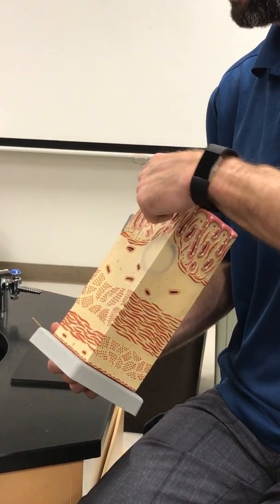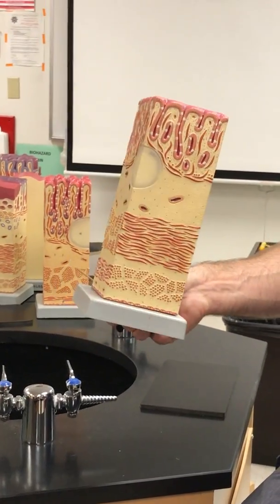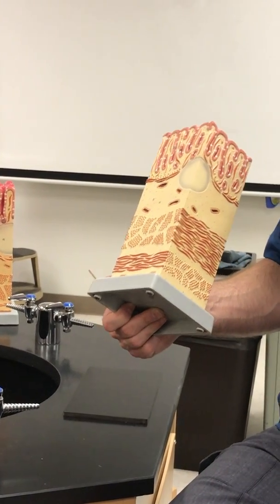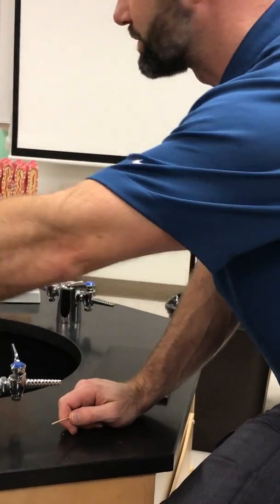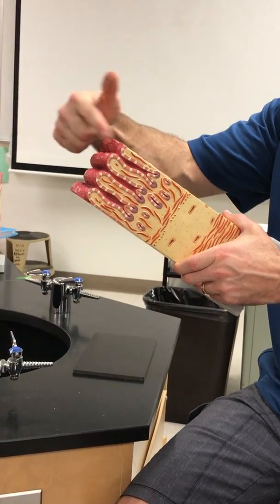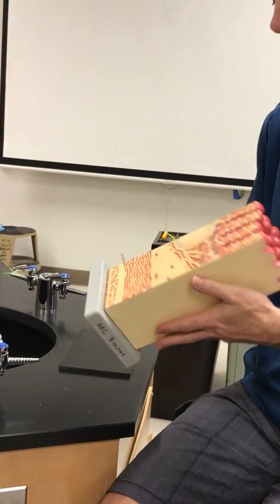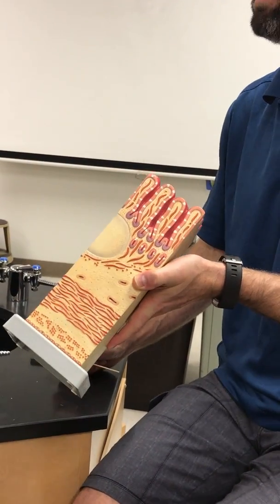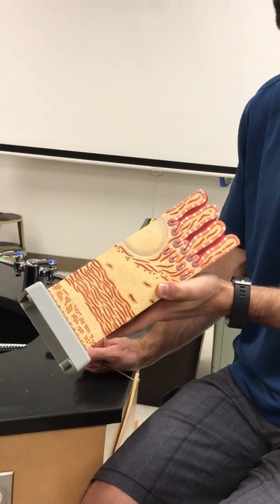The white cells, goblet. Should there be more or fewer than what's shown here? A lot more. It's large intestine. Tons of goblet cells in the mucosal glands of the large intestine. These are villi, so that tells you it must be small intestine. Very bottom, you have a serosa, so it can't be duodenum, so it's jejunoileum. Right? Throw them together, hybrid name, covers it all.